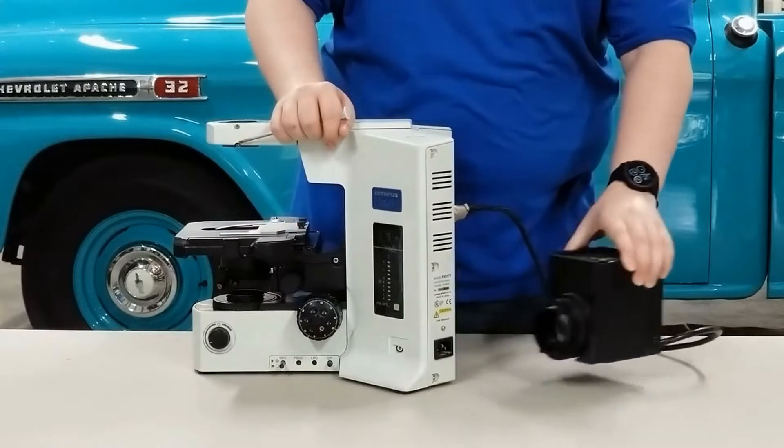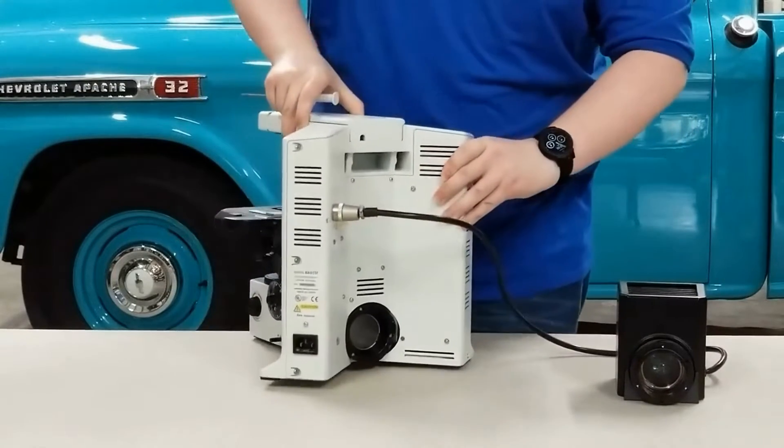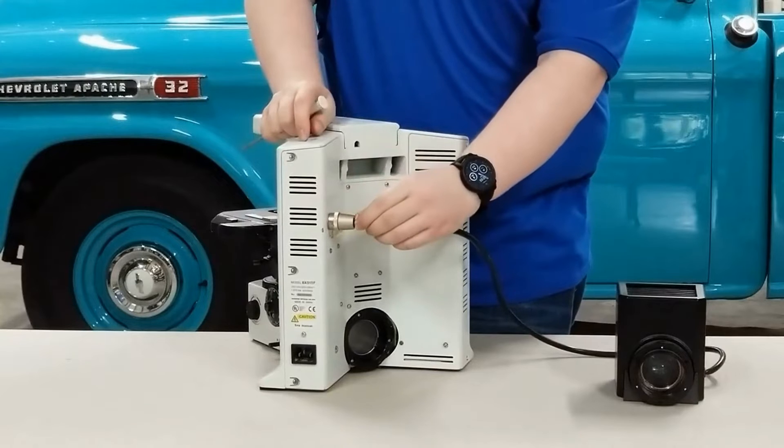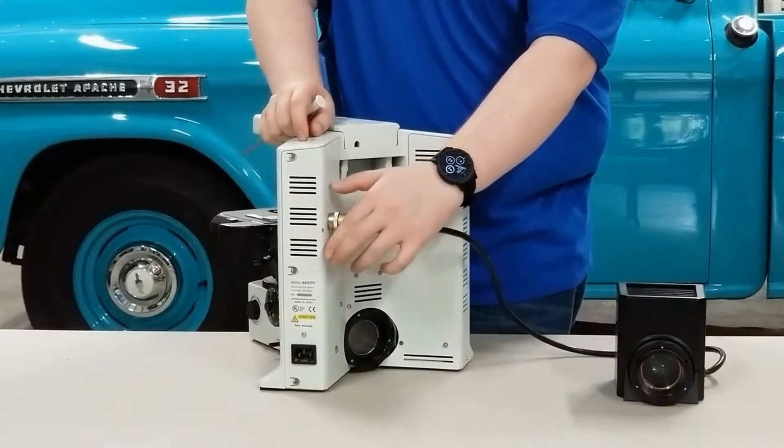Once you slide out the lamp house, turn the scope around and you'll see that silver plug on the back. Notice it has a spring-loaded collar like I'm showing you right now. Give it a quick twist and pull straight out and it will come detached.